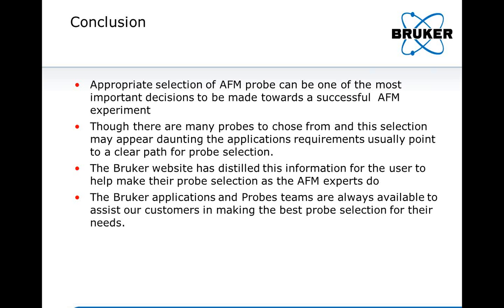Okay, I think now we're going to transition over a little bit to some of the applications, but this is still a little bit of a tie together. Is there any sample available for cell stiffness determination? So we currently do not have a commercial solution for this, but I know the team is experimenting with standards and probes for this. I will pass your question on to one of them. There's also a fair bit of research on this in the community to standardize this. I believe the COST Action in Europe has been a big effort on this.